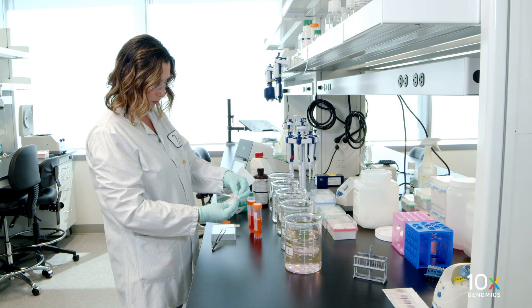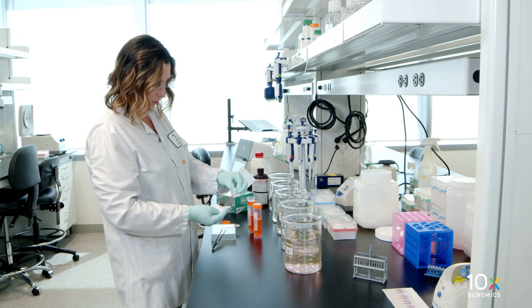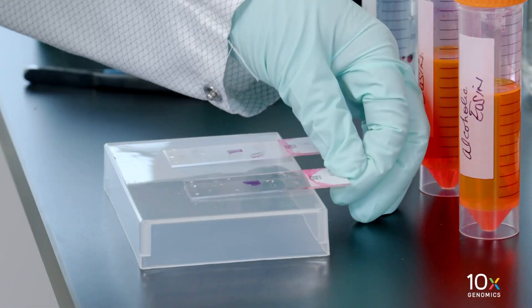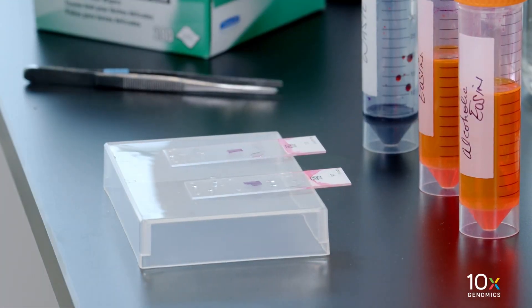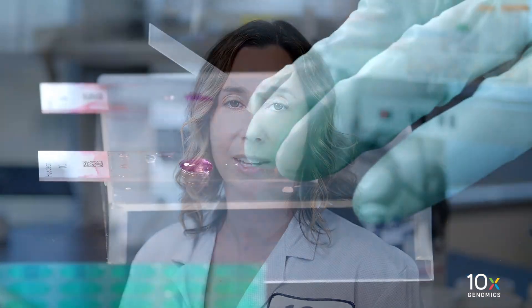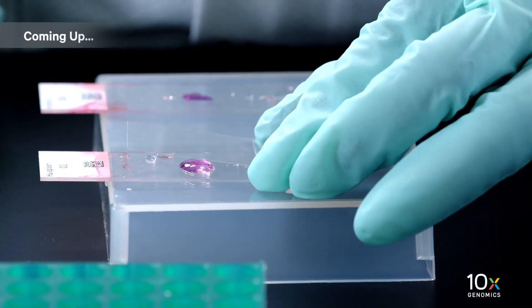Wipe the excess liquid from the back of the slide without touching the tissue section. Place the slides on a flat, clean, non-absorbent work surface. Some residual droplets may remain. Do not air-dry the slides. We have completed tissue staining. Next, we will mount a cover slip on the tissue slide.